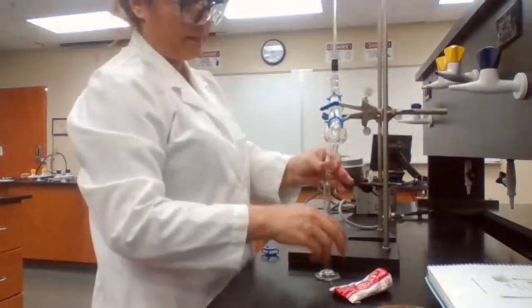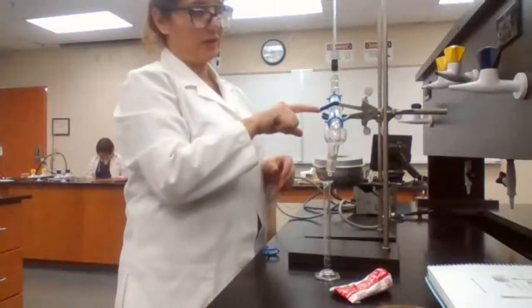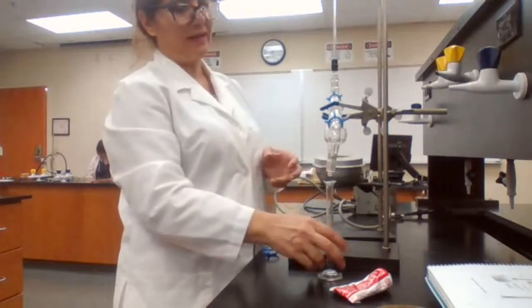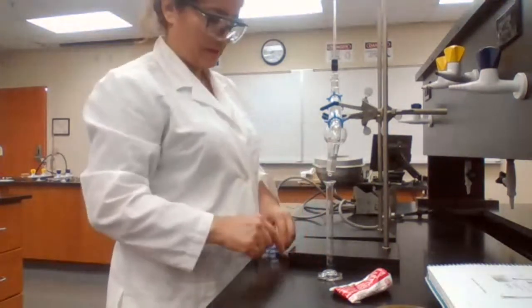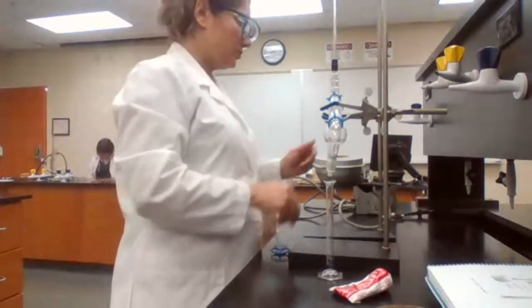If it's too high, if it's up high here, the hot solution, even though it condenses, it changes to liquid and it drops, but still is hot. And if you have too much of a gap here, because it's hot, some of it, before reaching the graduated cylinder, can actually vaporize.